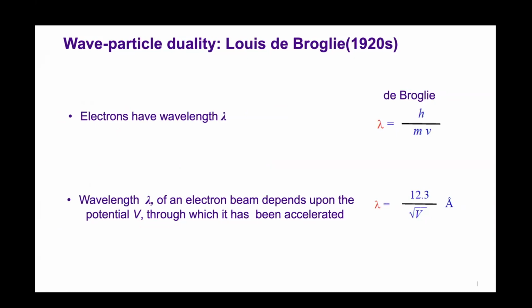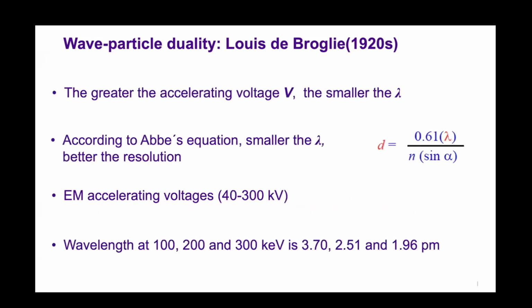And electrons, as you know, in the lamps, if you increase the voltage, you see brighter. So if you use higher accelerating voltage, can we make even a huge beam of electrons? Then the wavelength can be decreased: higher energy, lower wavelength. So you can use, then you know what is the wavelength. Then you can calculate this always in kilo electron volt. You can go to picometer.